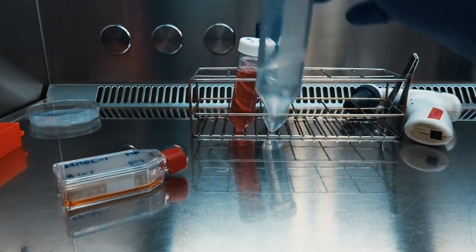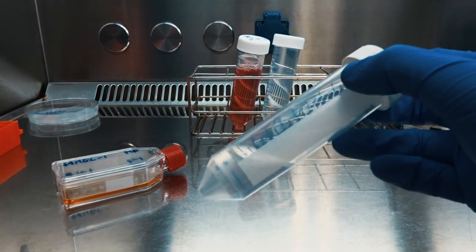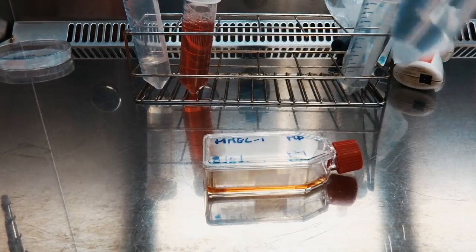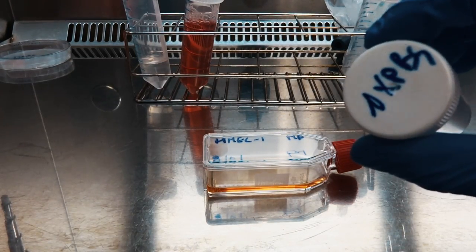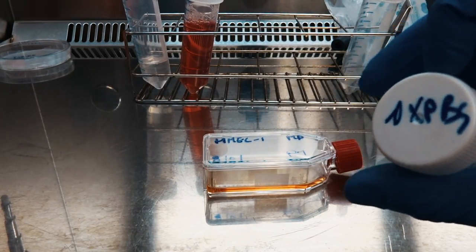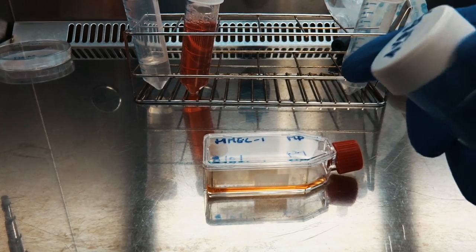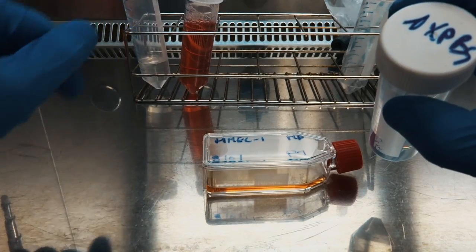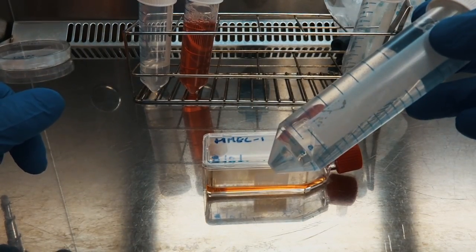Now I'm going to show you what to do after a week of growing your cells. First we're going to use trypsin, and this substance will allow us to decouple the cells from the surface of the flask. First I'm going to add PBS to flush the cells and remove the cell medium, because there are substances in the cell medium which can inhibit the working of the trypsin — that's why we need to flush them first.